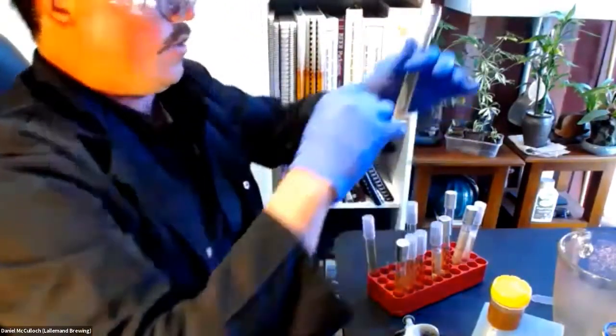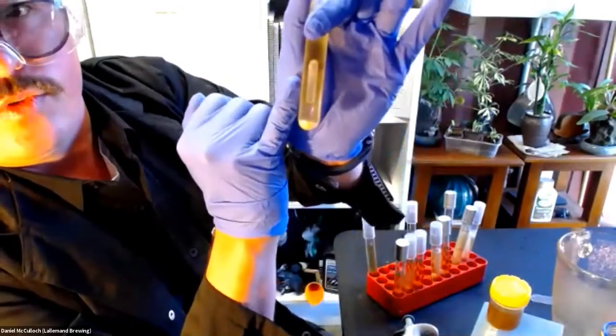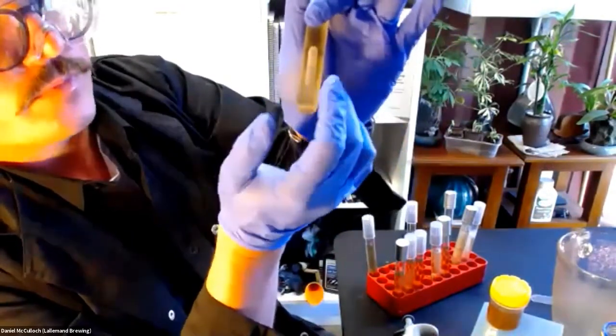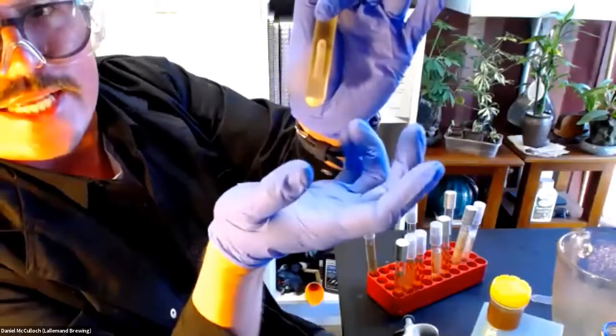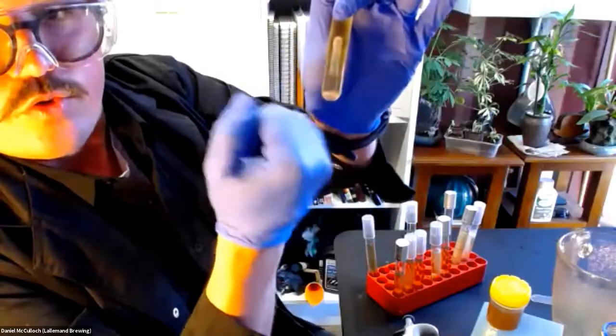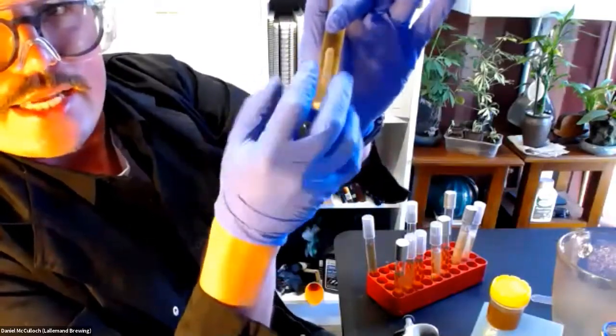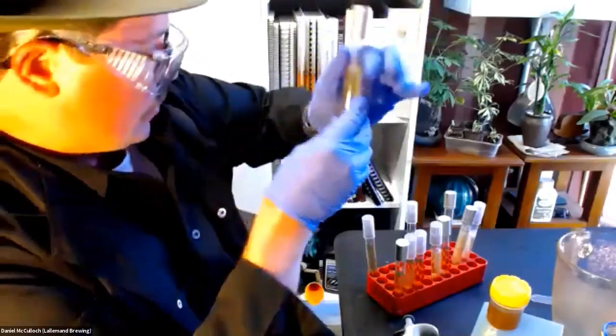Again, in a higher concentration of the Belle Saison, we can see that tube is just full of gas there. And that's showing that in this case, Belle Saison is excreting that enzyme, and it's breaking up those sugars into simple sugars that not only Belle Saison, but any other yeast that's present in the beer can consume.